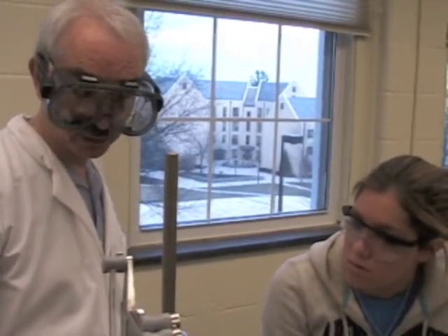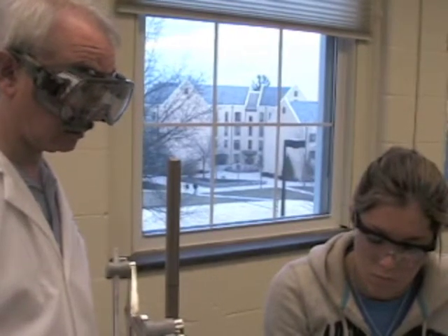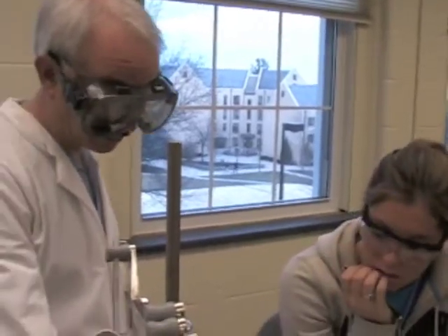Okay, so what's the objective of this part of the lab? What are we trying to calculate? Change in enthalpy. Right. And what are we graphing in order to do that? Graphing the different water pressure. The different water pressures, yes, the log of the pressure of water.